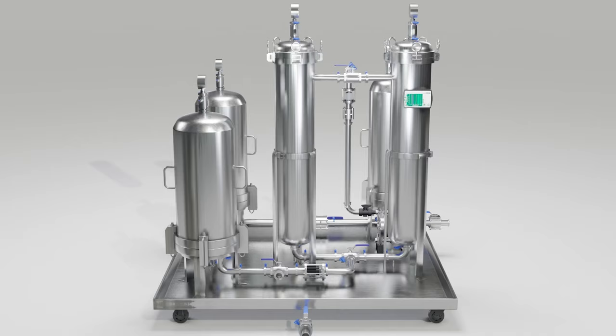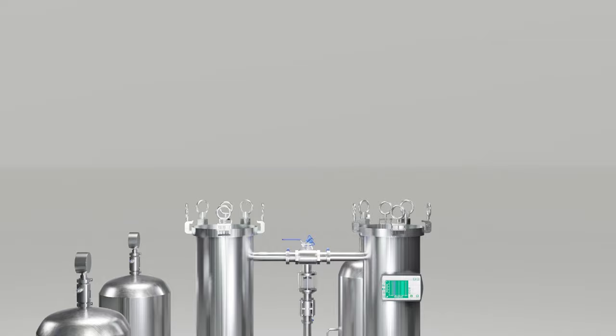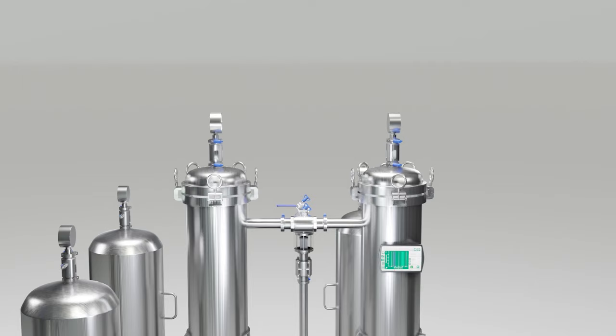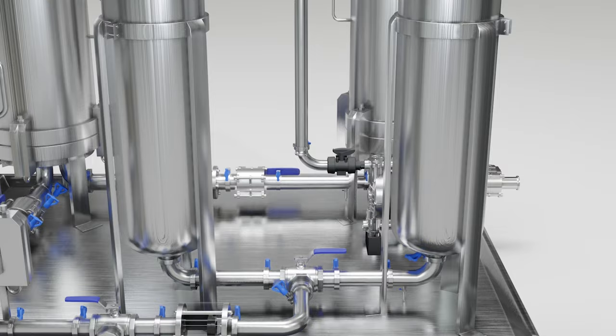Our filtration system features duplex bag filters. This feature lets you filter with two bags simultaneously or pause one bag for cleaning so you don't interrupt filtration for a bag clean-out.